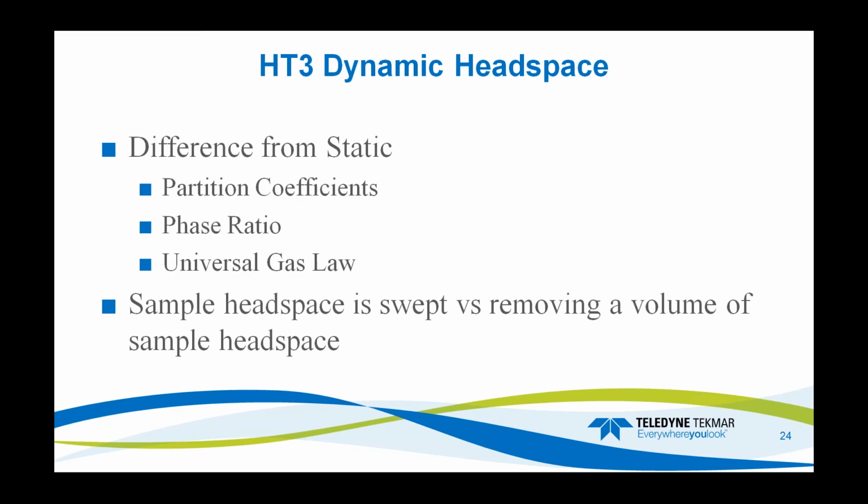It's a little different from static headspace. Partition coefficients, the phase ratios, and the universal gas laws still come into effect, but because we're sweeping that headspace, we're constantly changing that equilibrium. So the sample headspace is swept versus removing a volume of that sample headspace as you would in a static headspace system.